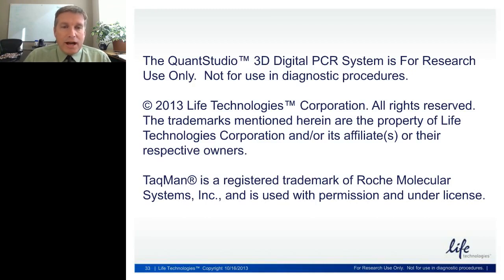Okay, and if you remember from your molecular biology and biochemistry, you should be able to back calculate the number of copies present in a particular mass of a length of DNA or RNA sequence. And from that, you can then estimate the concentration and the dilution you need to use to get to that sweet spot of about 1 copy per well.